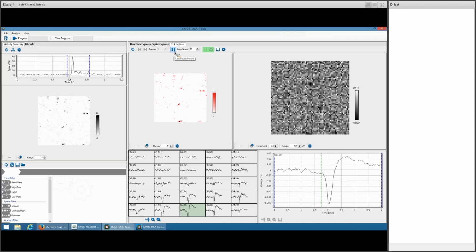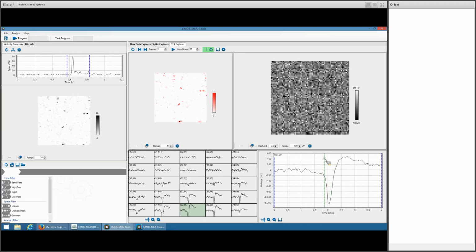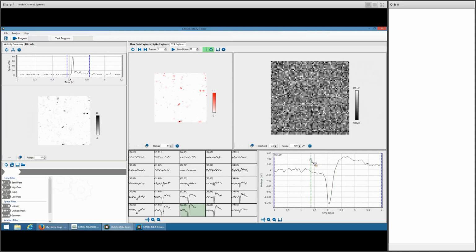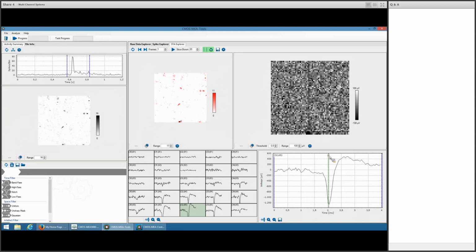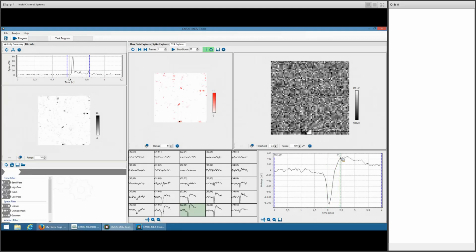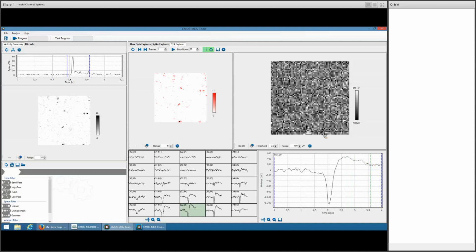And you see, now I can move back and forth. See, you get a dark spot first, gets negative, then a light spot gets positive. And if you're lucky, you can see actually the action potential running through the sensor spot somehow.